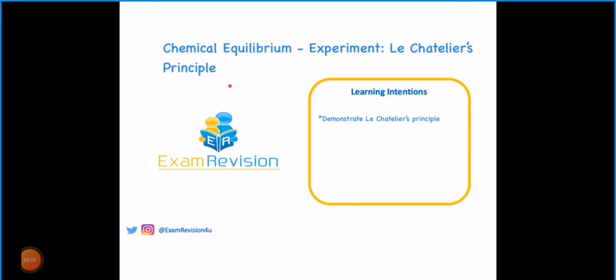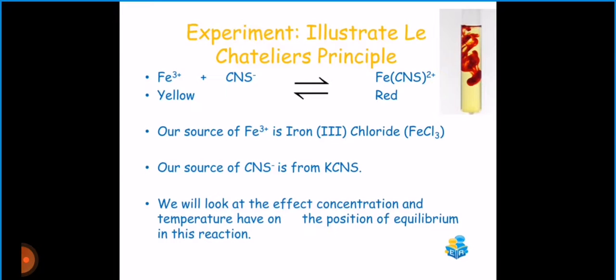An experiment that demonstrates Le Chatelier's principle using the reaction between iron 3 chloride and potassium thiocyanate. As I've just said, in our experiment we're going to illustrate Le Chatelier's principle using a reaction between iron 3 chloride and potassium thiocyanate.